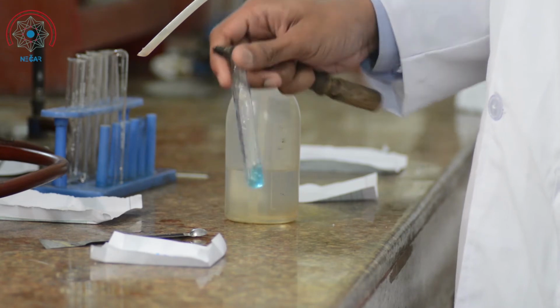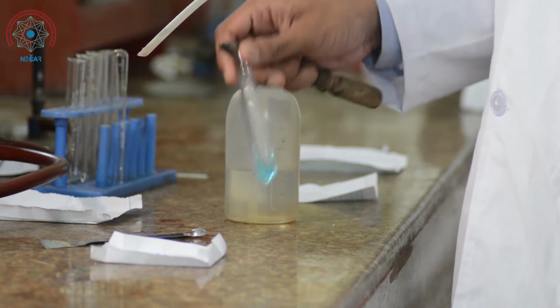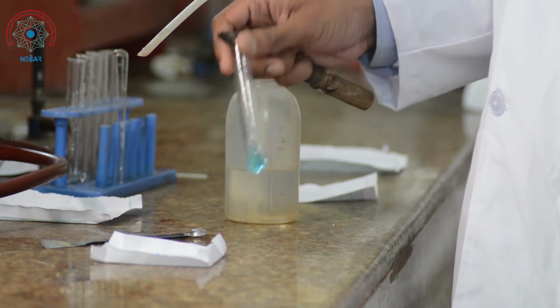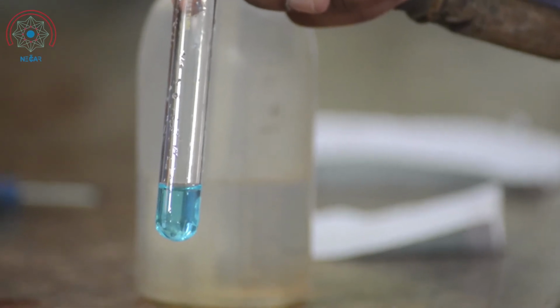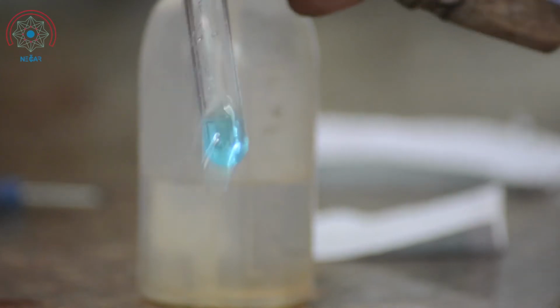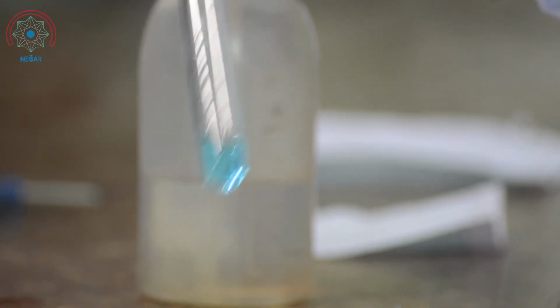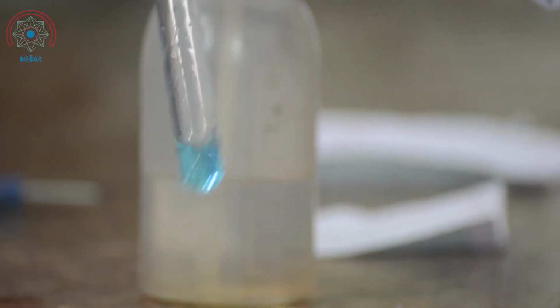Now we see that the salt is soluble, or has gone into the solvent. Therefore, we can say that it is soluble in water. If it were not soluble, there would be a precipitate at the bottom of the test tube. In that case, we have to check with other solvents like dilute HCl, concentrated HCl, etc.